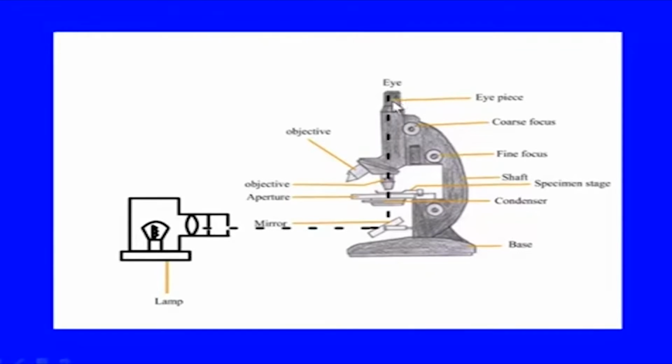If you recall, when you put your object within one focal length, a virtual image is formed, which is formed at the base of the microscope or in the mechanical tube, and this will act as an object for the eyes, and the eye lens will form the final image on the retina, which will be viewed on the retina as an enlarged or magnified image, because it occupies a larger area on the eyes.